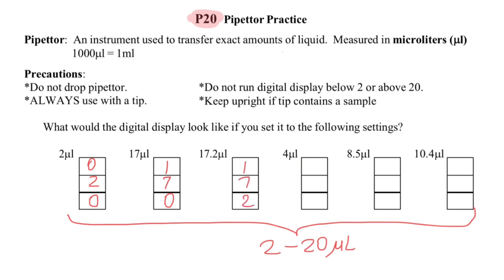4 microliters would be 4 and 0 here. 8.5 microliters is going to be 8 and 5 here. And 10.4 is going to be 1, 0, and 4 here.